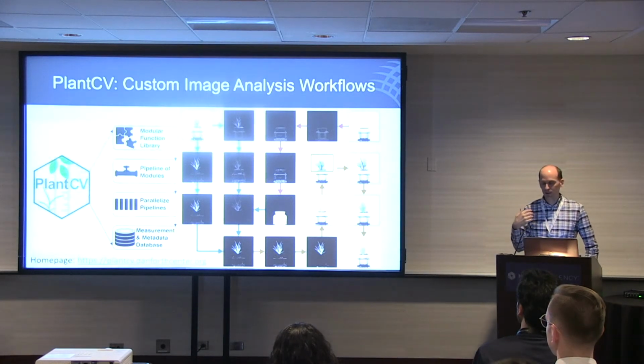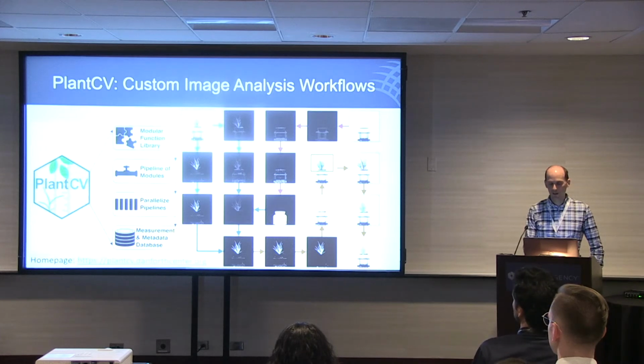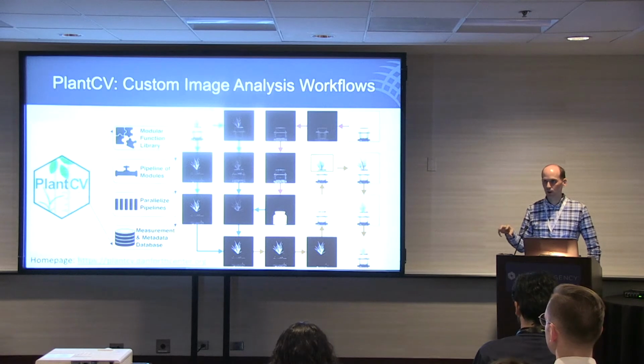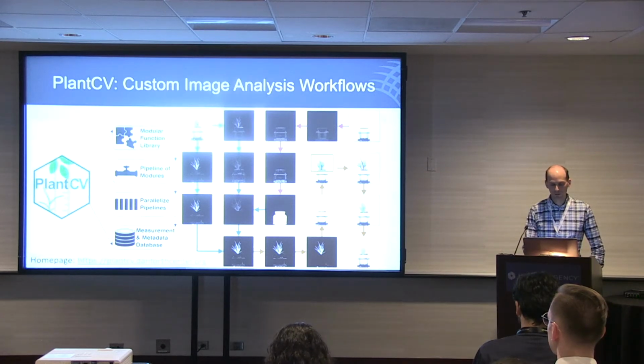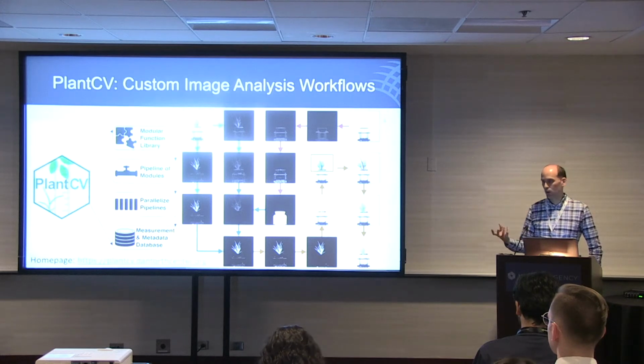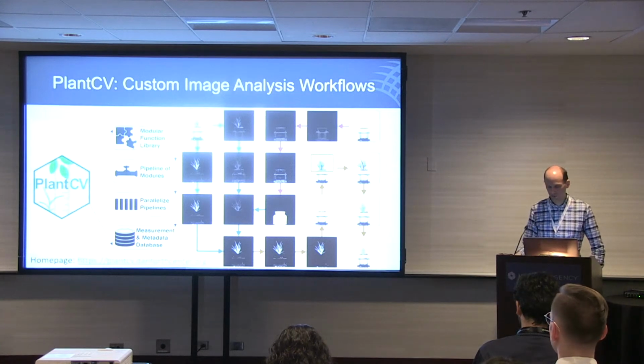One of the things my group works on is image analysis software. So we have this project called PlantCV. I won't go into the details, but it's a Python package, and it was designed to be modular so that we could build custom image analysis workflows by stitching together lots of simple image processing tasks. So this is just an example of one of these workflows that's built. And then once you build a workflow that can work on a data set, you can do parallel computing to analyze the whole data set using that workflow.